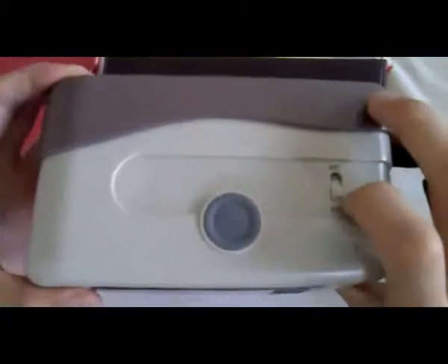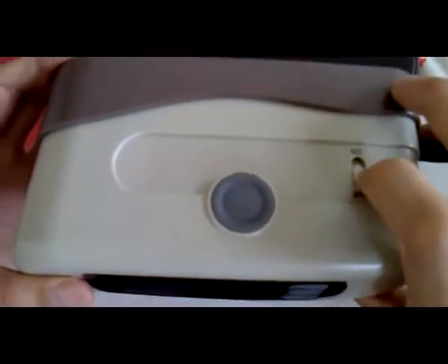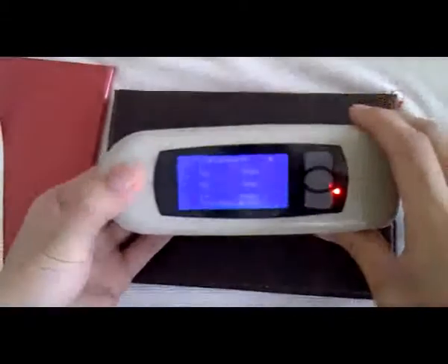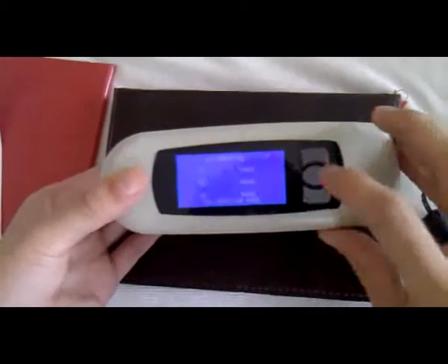First, we turn on the gloss meter. Now, please notice — we must push down the gloss meter climbing the calibration board. Turn on. It will take an automatic calibration. All is passed.